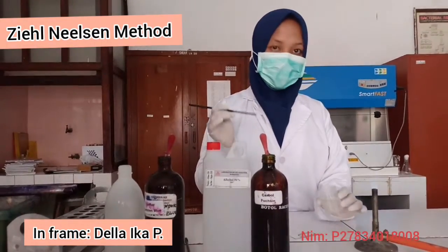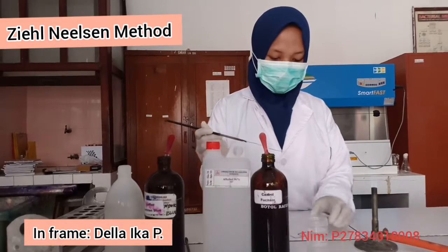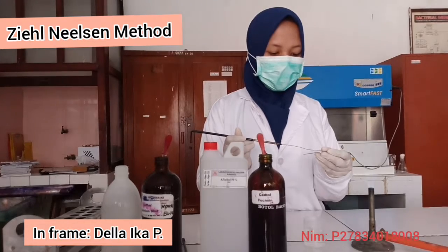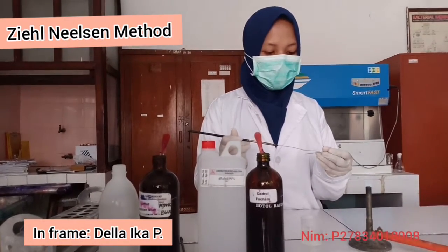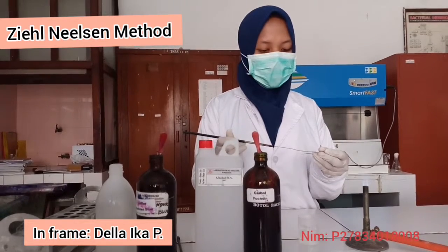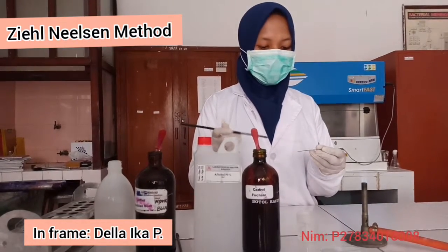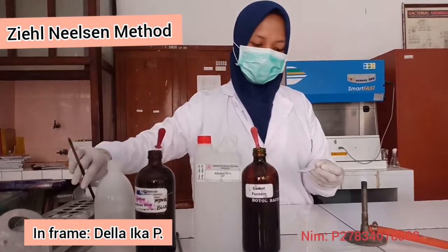And then take the sample and put it down on the object glass. Flatten the preparation slightly oval with a length of 3 cm and width of 2 cm. Let it dry in the air.